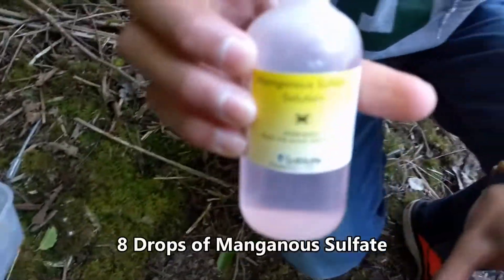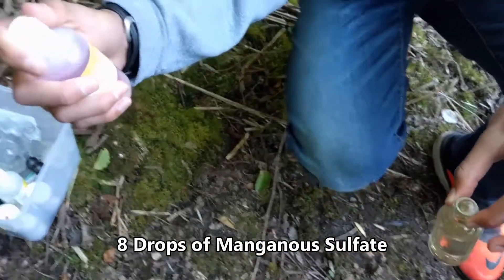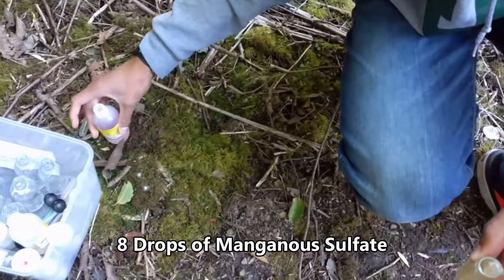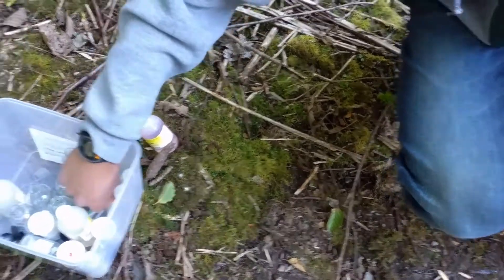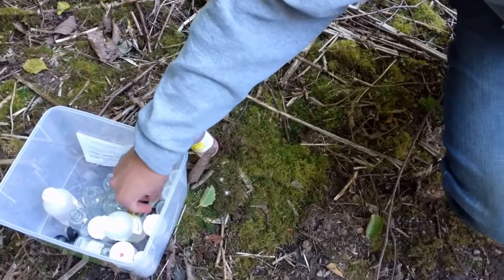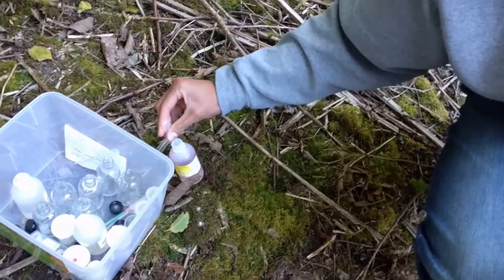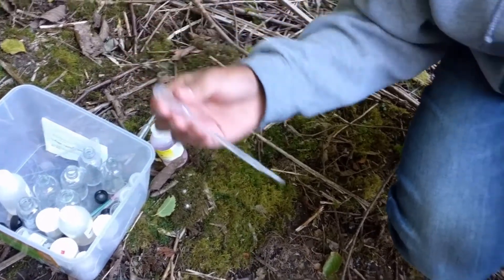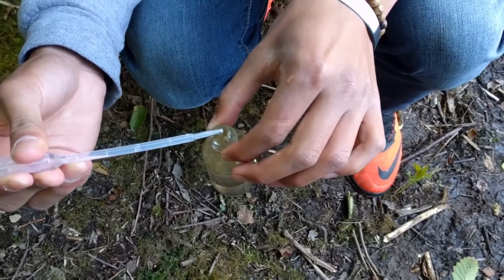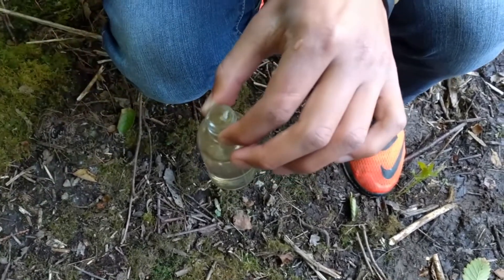We're going to start with 8 drops of manganese sulfate. Okay, 1, 2, 3, 4, 5, 6... 8 drops total.